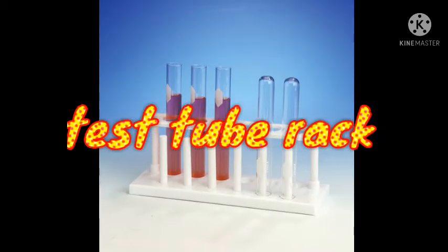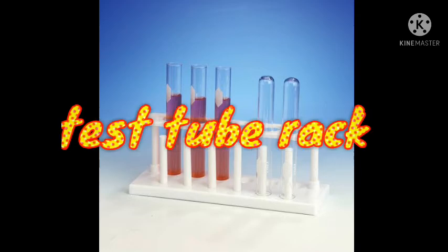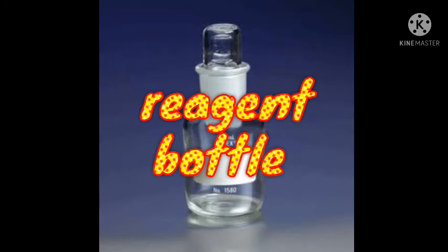Next, we have the test tube rack. The test tube rack is a piece of laboratory equipment used to hold multiple test tubes upright at the same time. As you can see, it holds multiple test tubes at the same time. Next, reagent bottles are used to store chemicals in liquid or powder form.